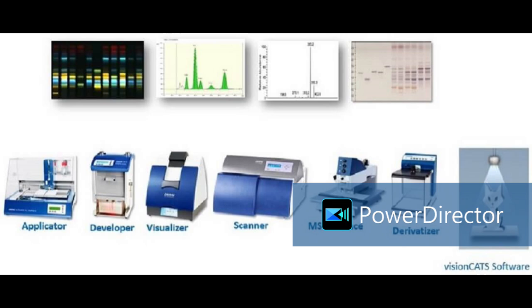Sir, from the start position, 0 to 70 mm, depends on polarity, but your analysis should be targeted. You select the mobile phase accordingly, and you have to focus on your particular bands of interest. If you need these 4-5 components separated from other samples, then you will get very good separation. Generally, for all sample polarities, we can separate using 3 different polarity systems.